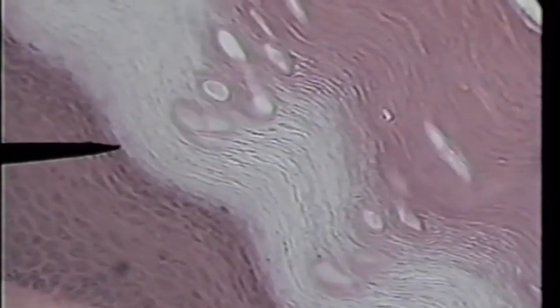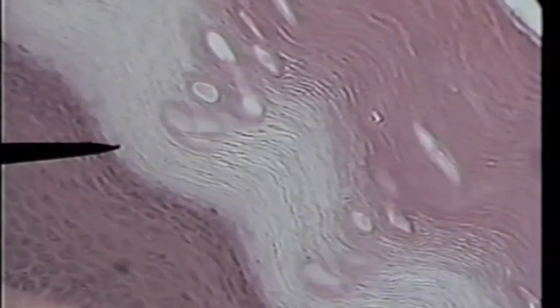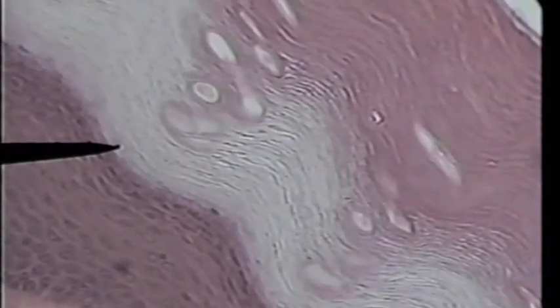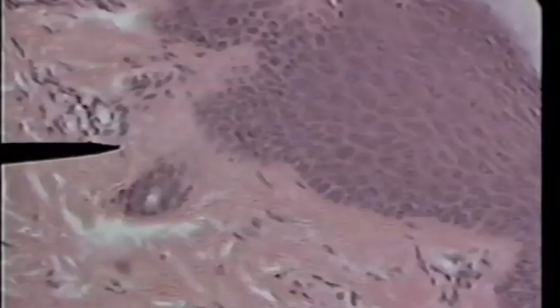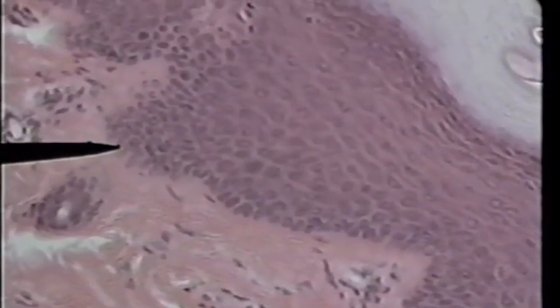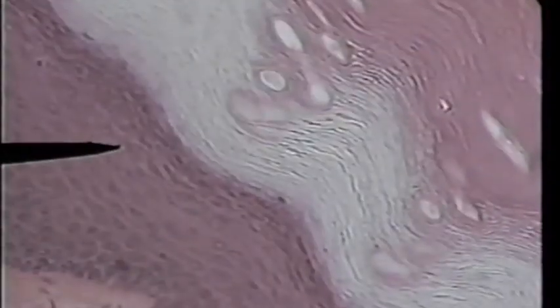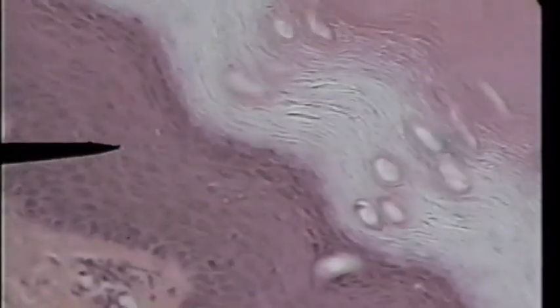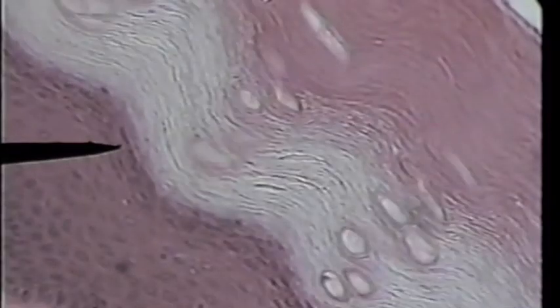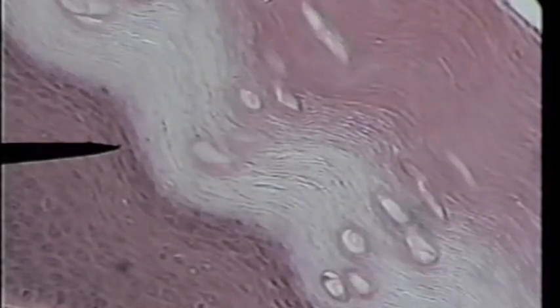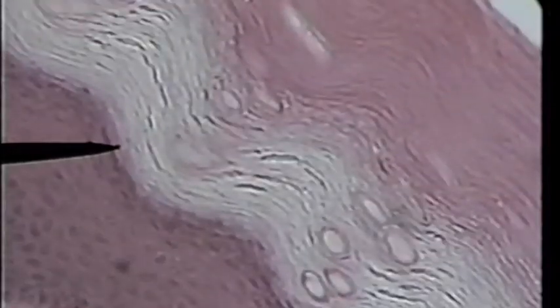From the tip of the pointer out to the free surface, you get a hint that all that area on the right is many, many layers of dead flattened cells — that would be the keratinized region. The tip of the pointer now is in the living cells. This is the most superficial layer of living cells, with the dead cells being superficial to it.